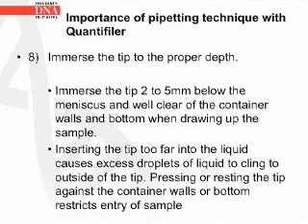Number 8. Immerse the tip to the proper depth. Immerse the tip 2 to 5 mm below the meniscus and well clear of the container walls and bottom when drawing up the sample. Inserting the tip too far into the liquid causes excess droplets of liquid to cling to the outside of the tip. Pressing or resting the tip against the container walls or bottom restricts the entry of the sample.